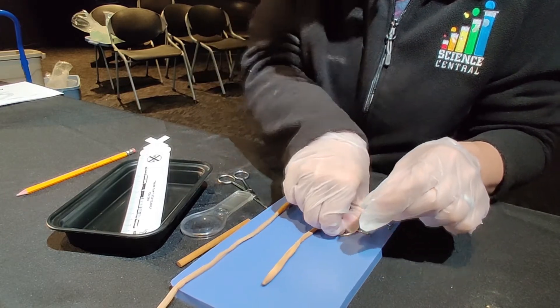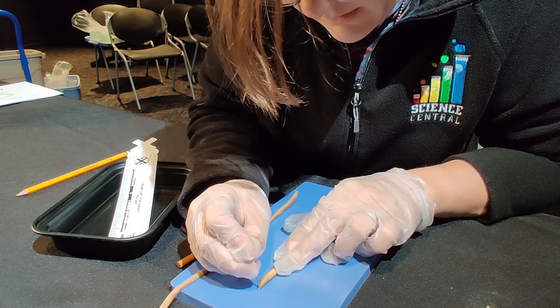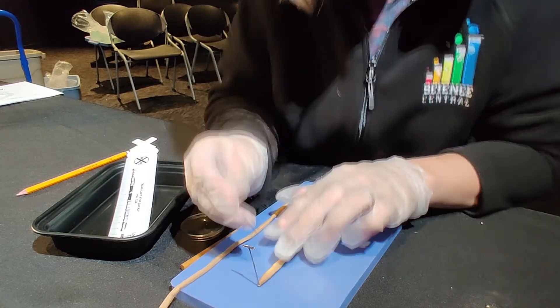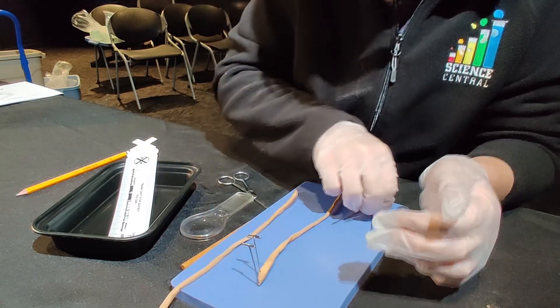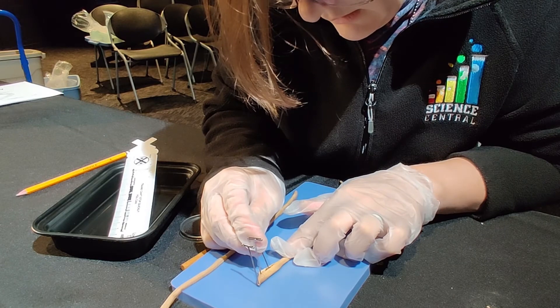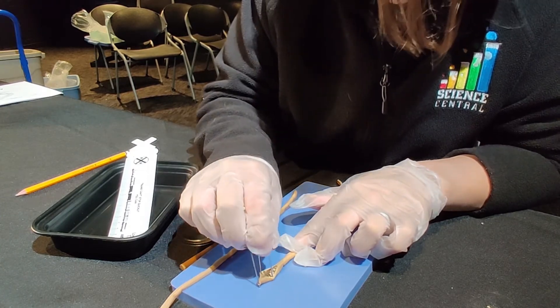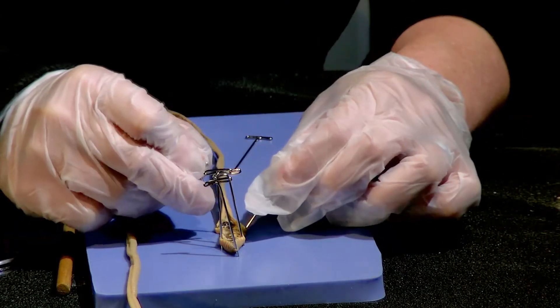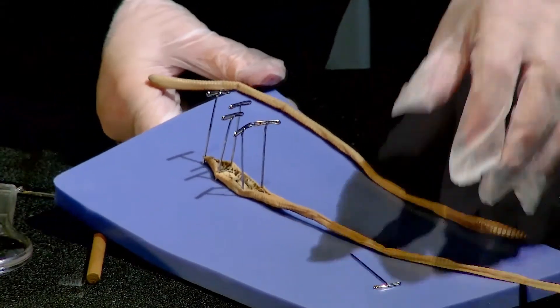They will use their pins to pin their earthworm by the mouth to their dissection pad, and then pinning just the skin to the side so that it opens up the earthworm and we can see its internal organs.